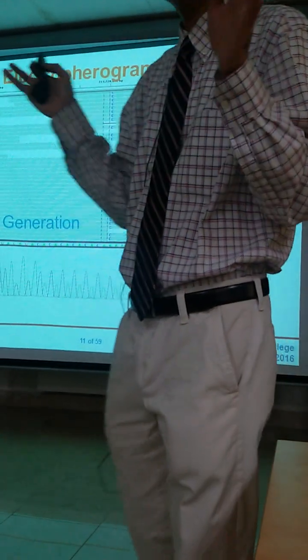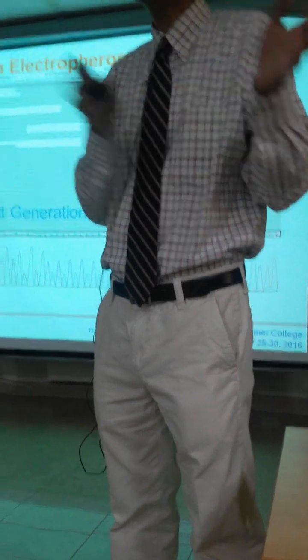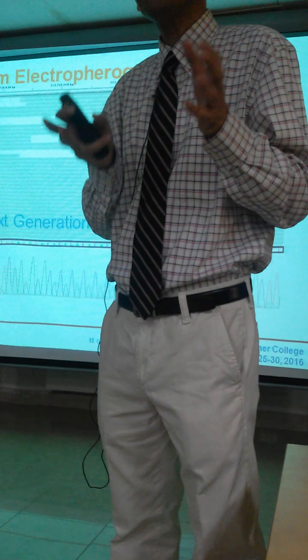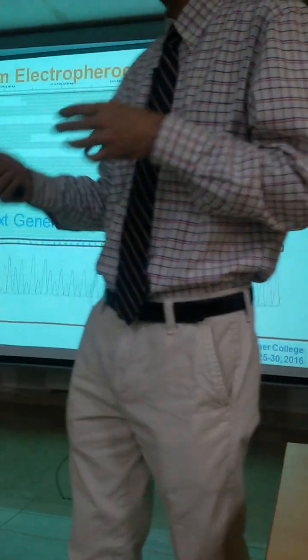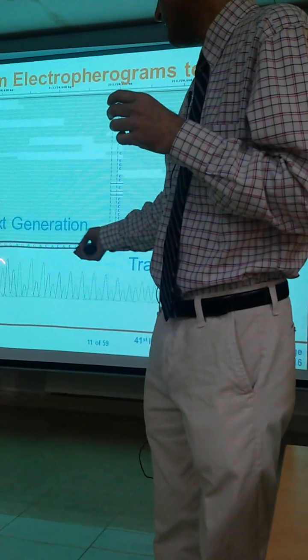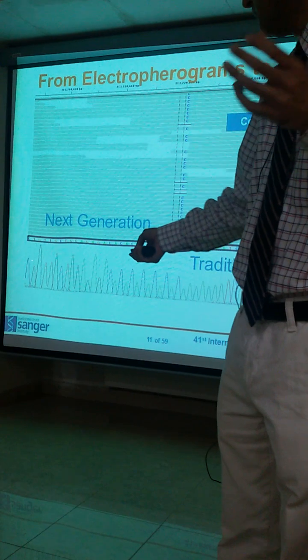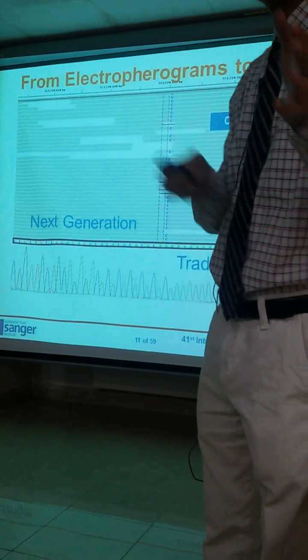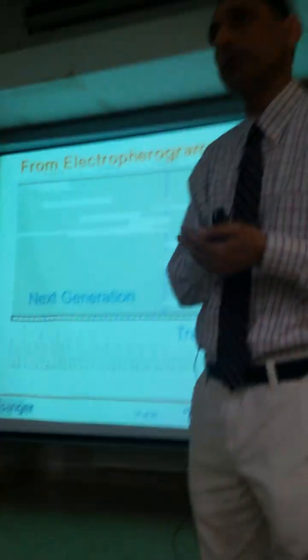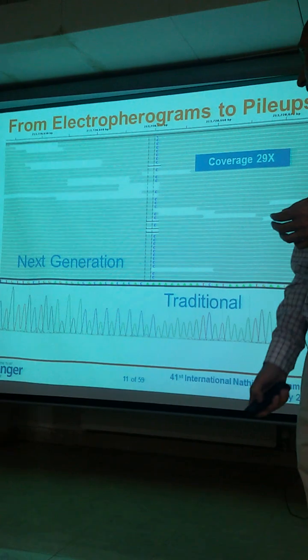Okay, so basically the technique is you take the DNA from a genome, break it down into different short fragments. You can either clone it or just do a PCR amplification and then run it on the sequencer using sequencing primers. And what you get is a readout of ACTGs because each of the dideoxy has a different color code. And when it stops, the shorter the fragment is, the closest to the starting position, the longer fragment is close to the end, and then you just read it from the 5' to the 3' direction there.